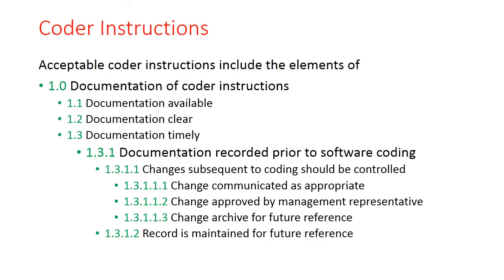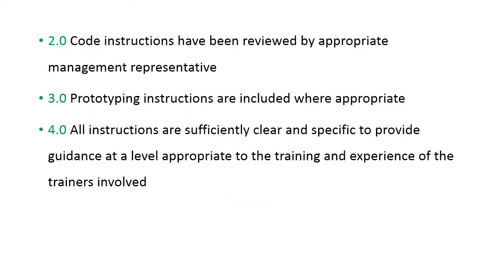Whatever changes have been made in the document should be approved by the management representative. Proper archival of documentation, and documents should be maintained properly for future references. Code instruction has been reviewed by appropriate management representative. Now please try to remember that laboratory management may not be an expert in computer software coding.